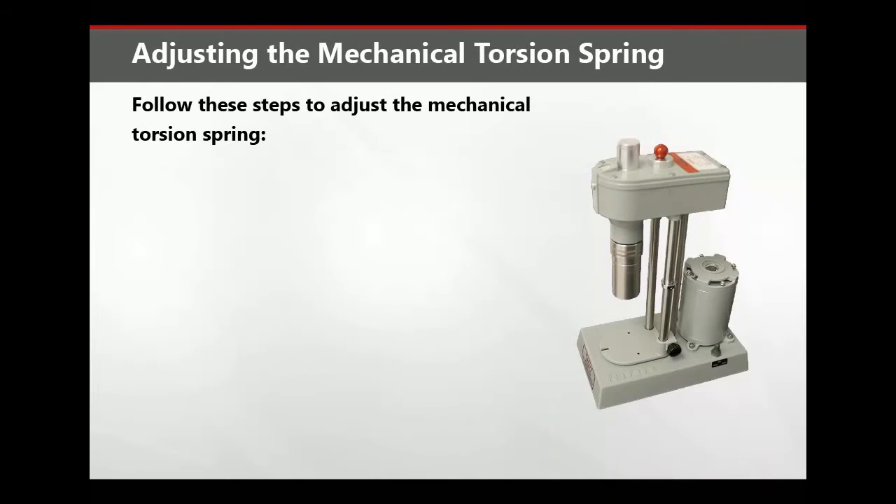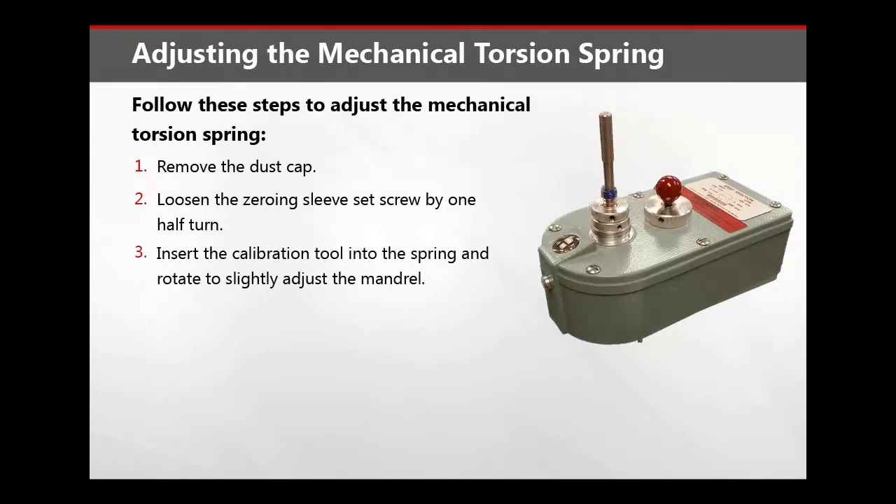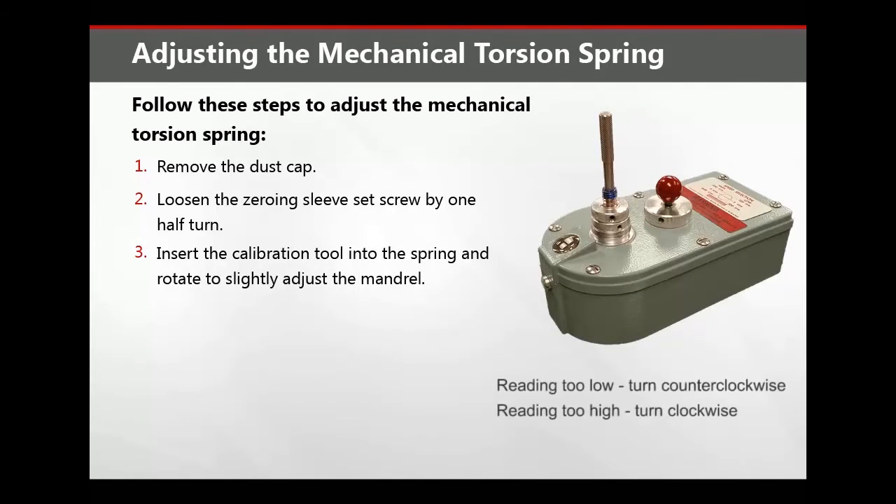Follow these steps to adjust the mechanical torsion spring. First, remove the dust cap, then loosen the zeroing sleeve set screw by one half turn. Insert the calibration tool into the spring and rotate it to slightly adjust the mandrel.